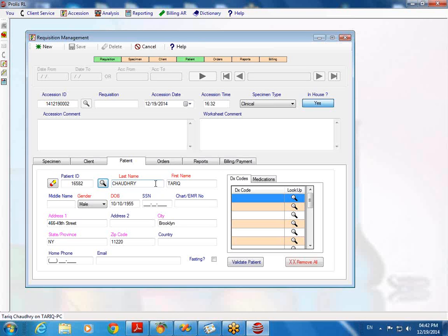We don't provide the user the capability to add fields, but by all means, we could provide you some custom table, and of course, we could provide you a limited customization, even elaborated customization, but that will happen when you are satisfied with the system, when you acquire the system. Right, that is the customization we do provide to the laboratories. Yes. Okay, that would be sufficient.